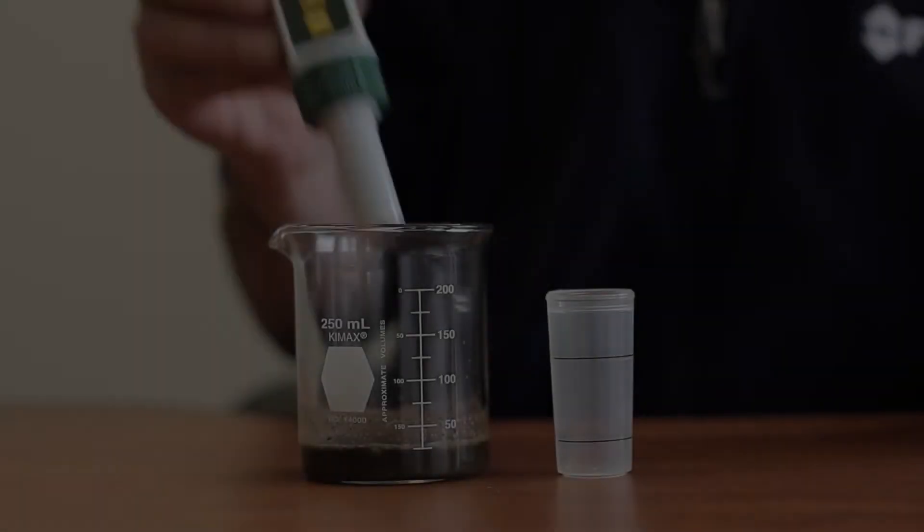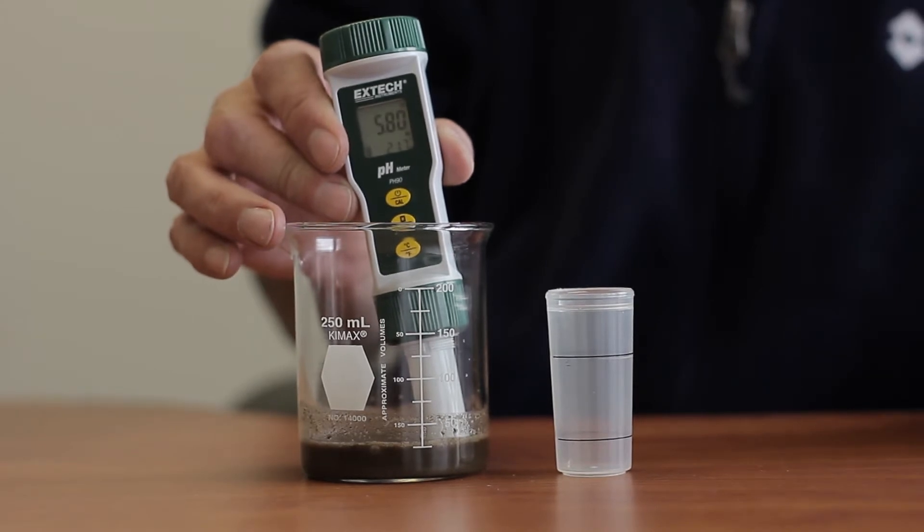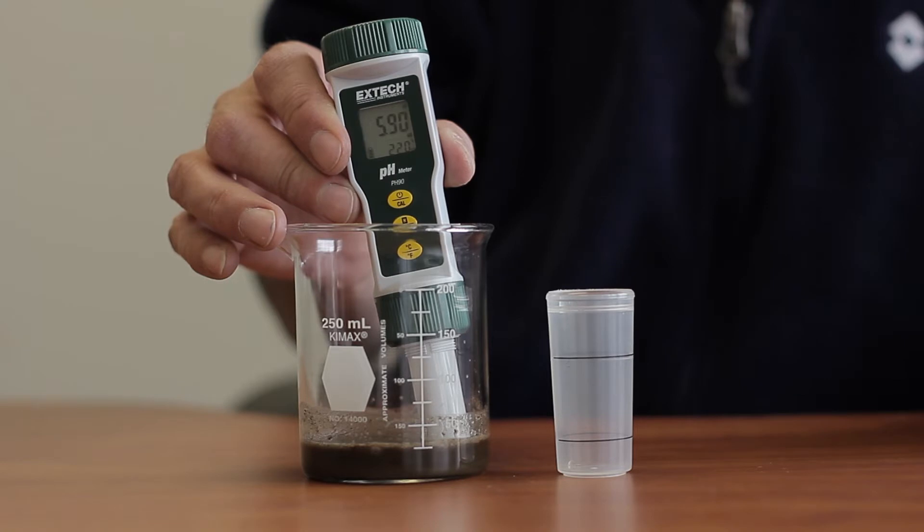When you're done waiting, you can introduce the calibrated pH meter to the sample and take the test. Here we can see our soil has a pH value of about 6, which is slightly acidic.